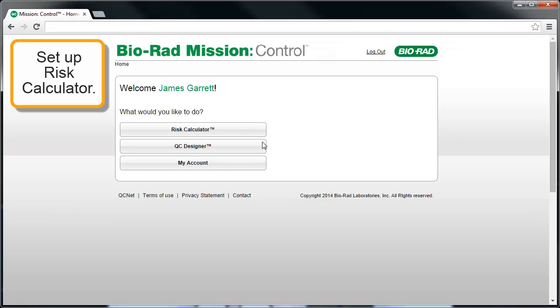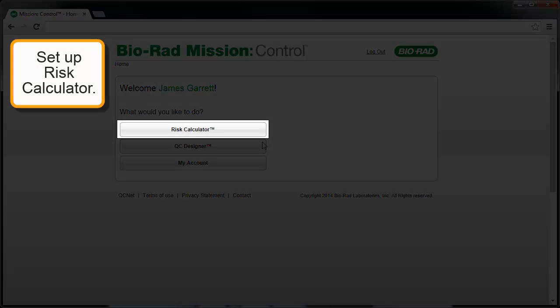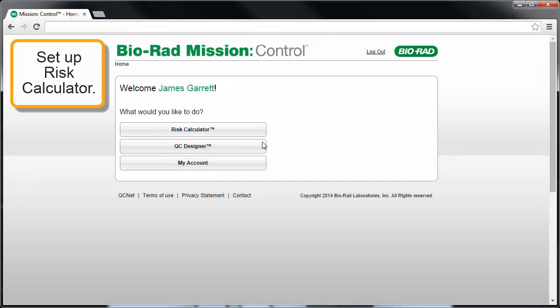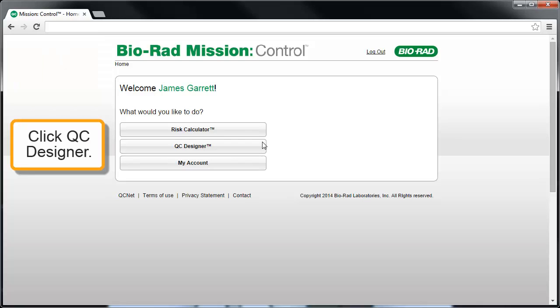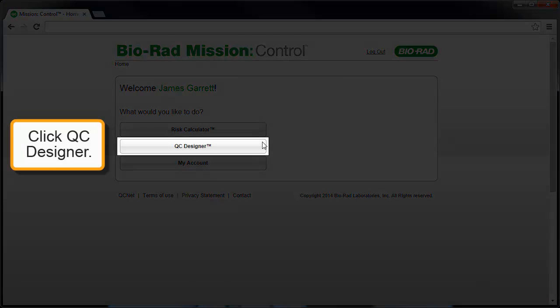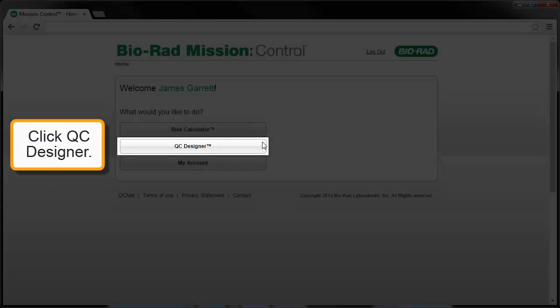The use of QC Designer requires that you have already set up the instrument and tests in Risk Calculator. We recommend that you view our Risk Calculator video if you need more information. After Risk Calculator setup is complete, click on the QC Designer button.